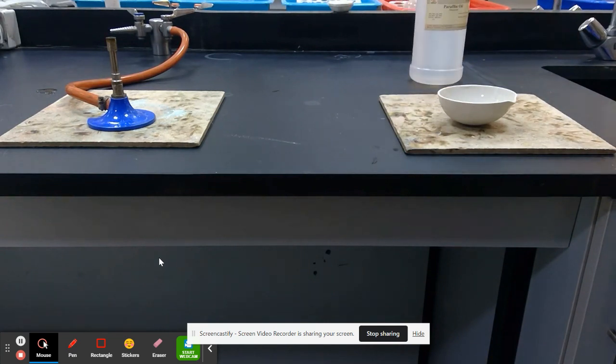So on the left we've got the methane from our gas tap, which is a very short hydrocarbon. It's got one carbon in its chain. And then paraffin oil has around 20 carbons in its chain. And we're going to compare the properties of those two things.